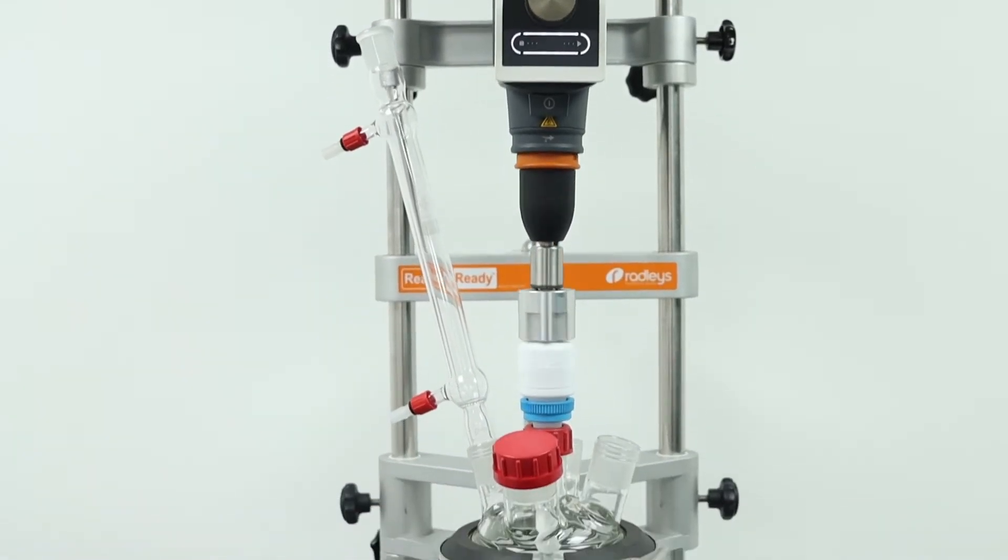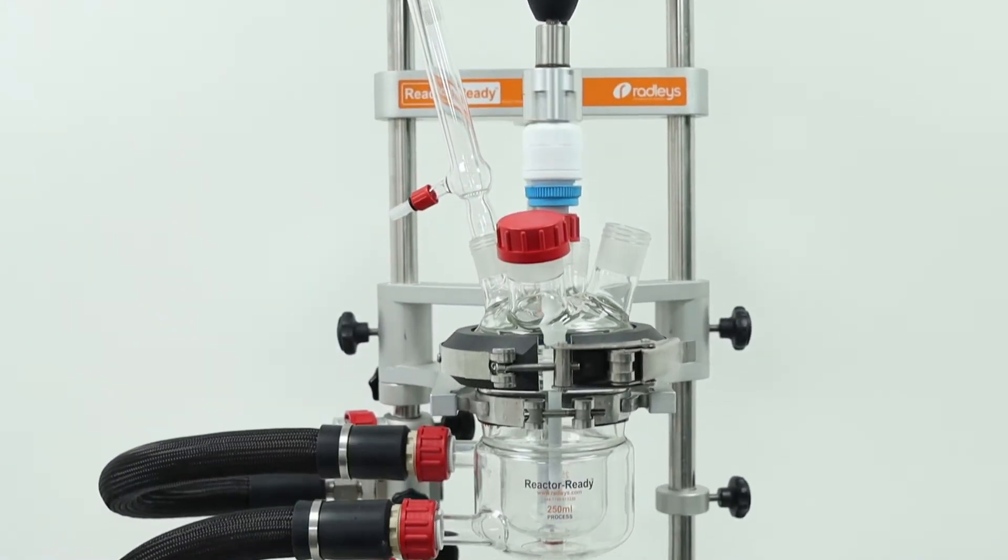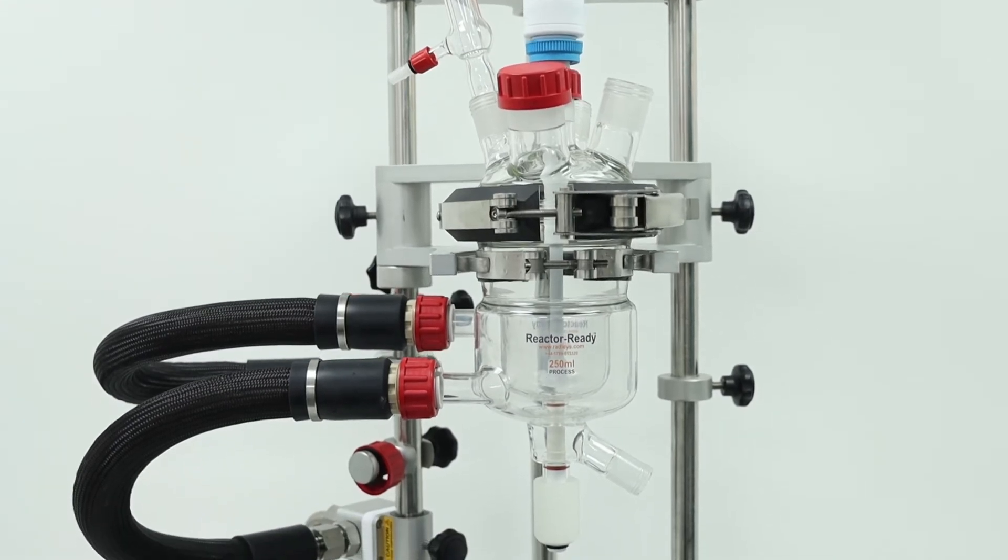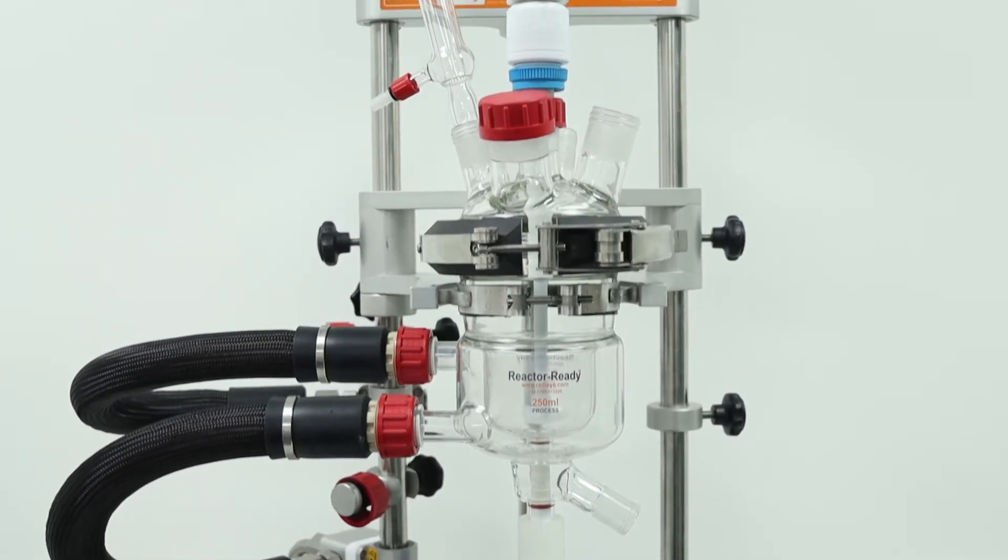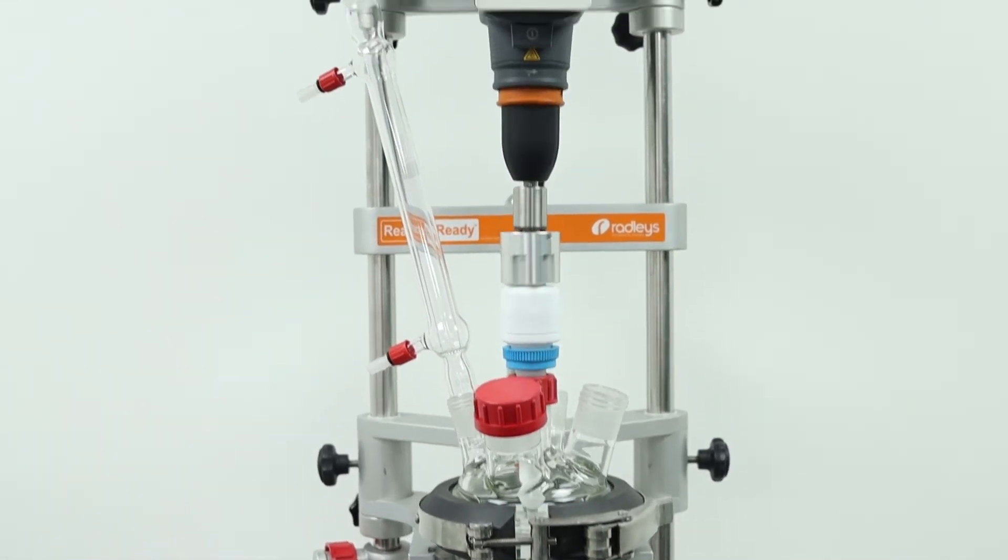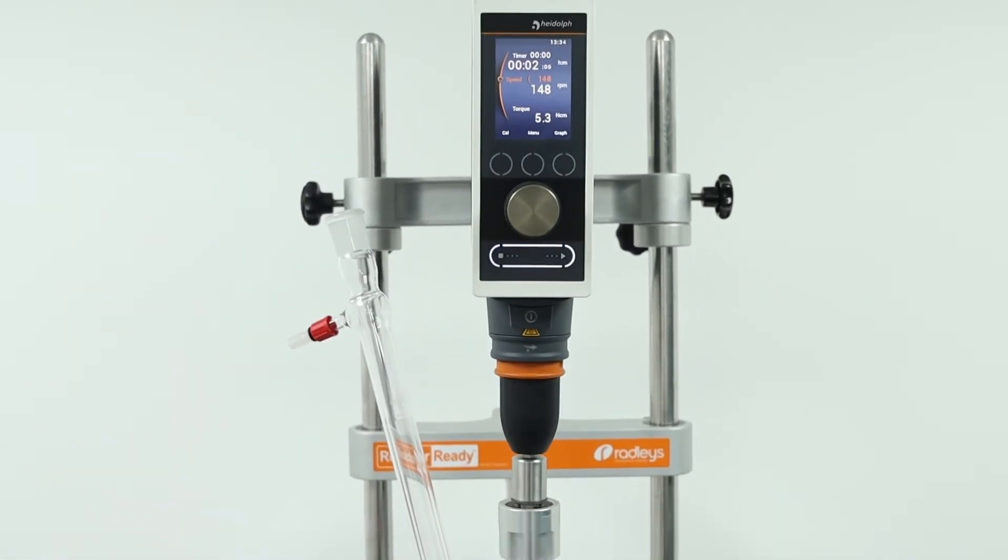In chemical development process research and development labs looking to scale up and scale down reactions need to be able to work effectively with small reaction volumes and still simulate plant conditions.